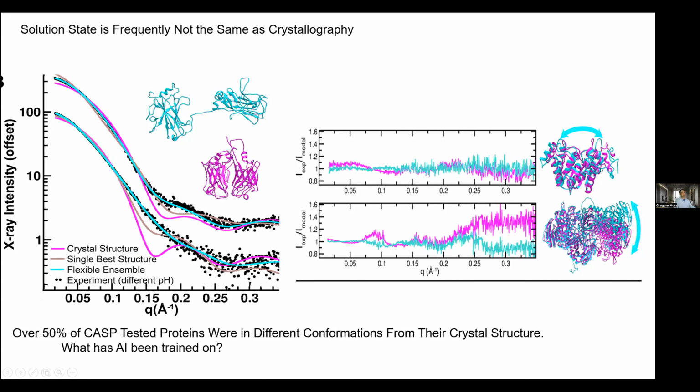There are also domain motions, so just a little tweaking of the protein architecture that will change between them. So these are residuals from the measured SAXS to the SAXS for the crystalline structure. So these are differences, and then using all the tools we have, we can refine the residual to be flatter or in better agreement. So anyway, it's a very remarkable number.